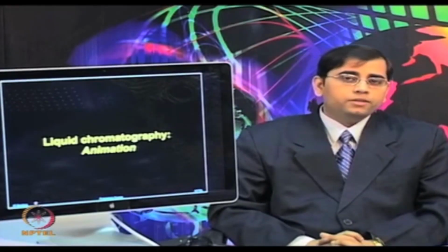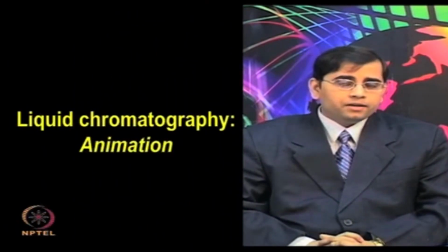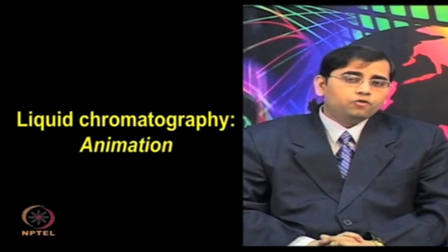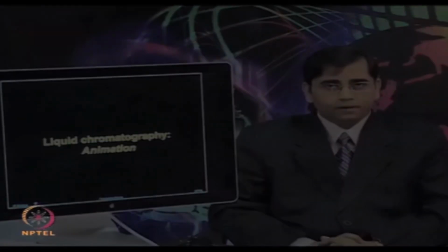Let me describe some of the concepts involved in liquid chromatography in the following animation. I will also discuss MudPIT and some of the chip based approaches which are integrated for proteomic application with liquid chromatography. So, let us discuss these concepts in the following animation.